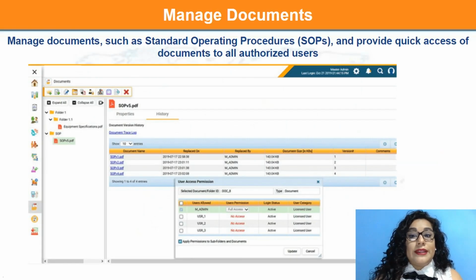So, a good LIMS manages all the internal and external documents, consent forms, and quality management manuals. It also tracks the revision history of each document to ensure that staff members access only the latest version. It also provides role-based document access rights to the staff, providing controlled access to confidential documents.